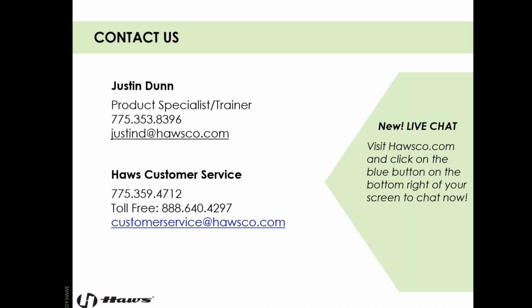Great. So this is a California specific question. Yay. But we get this question a lot, so I feel it's worth pointing out. Okay. In California, they reference an outdated ANSI standard and only require monthly activation. True. Have you found the current ANSI standard cited in California? So I think where this question is going, weekly versus monthly, right? Right. And can you speak to that a little bit?